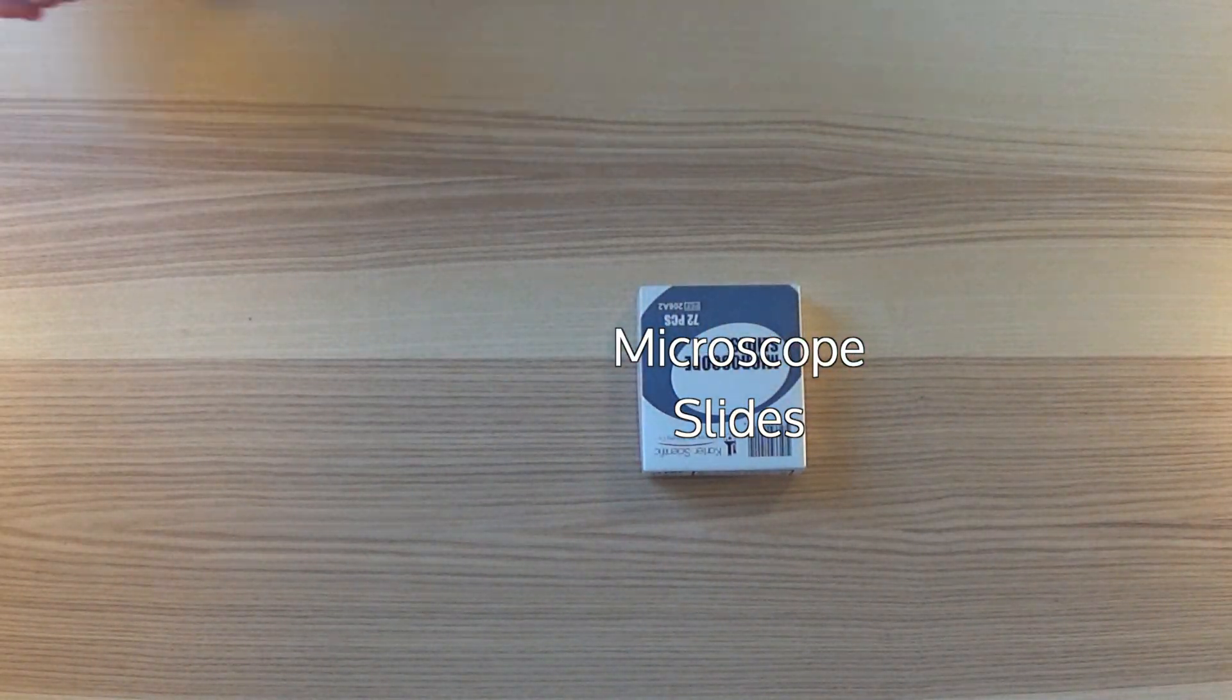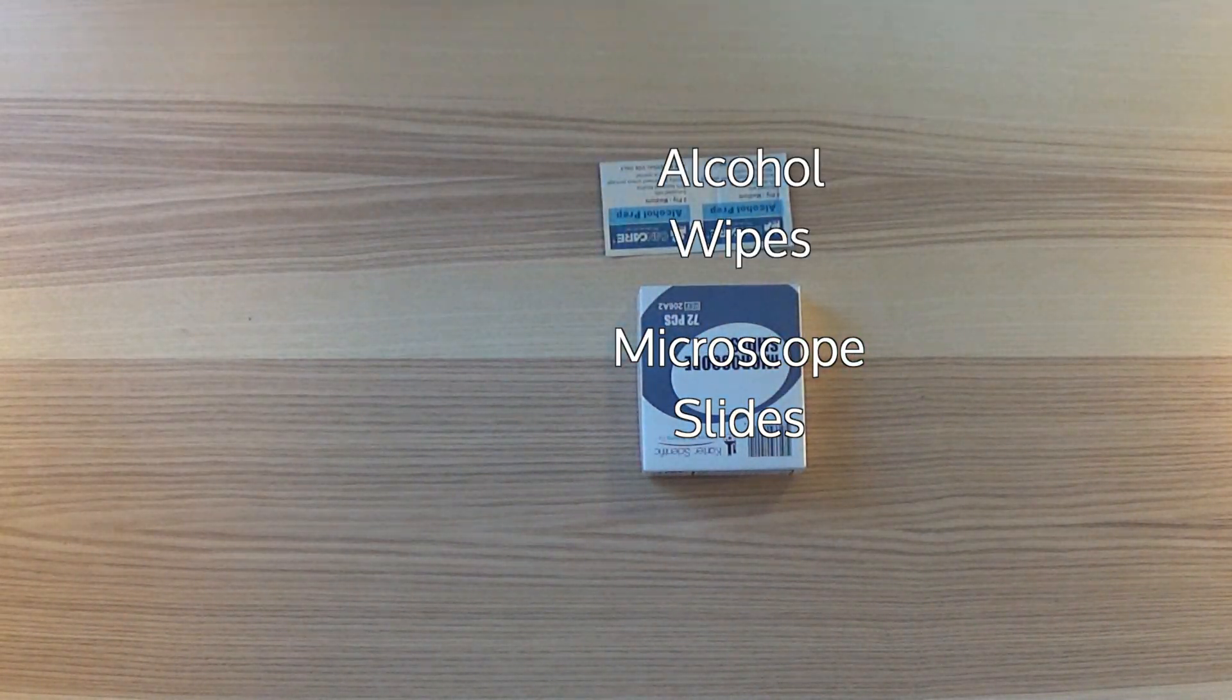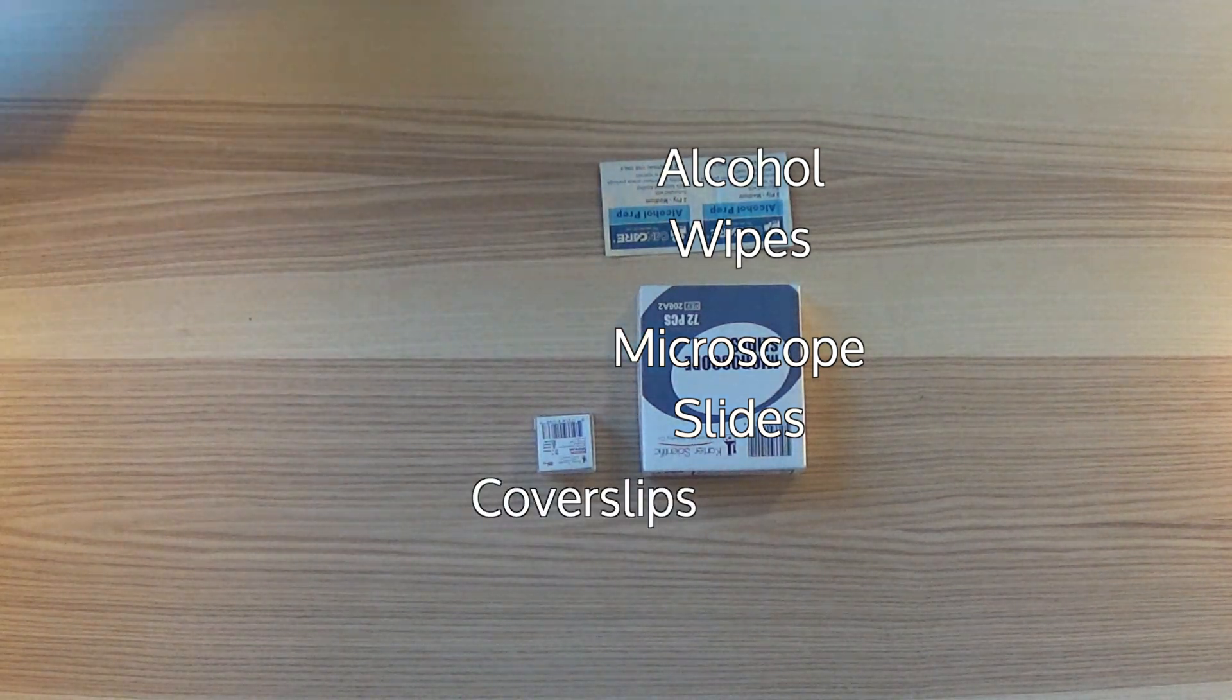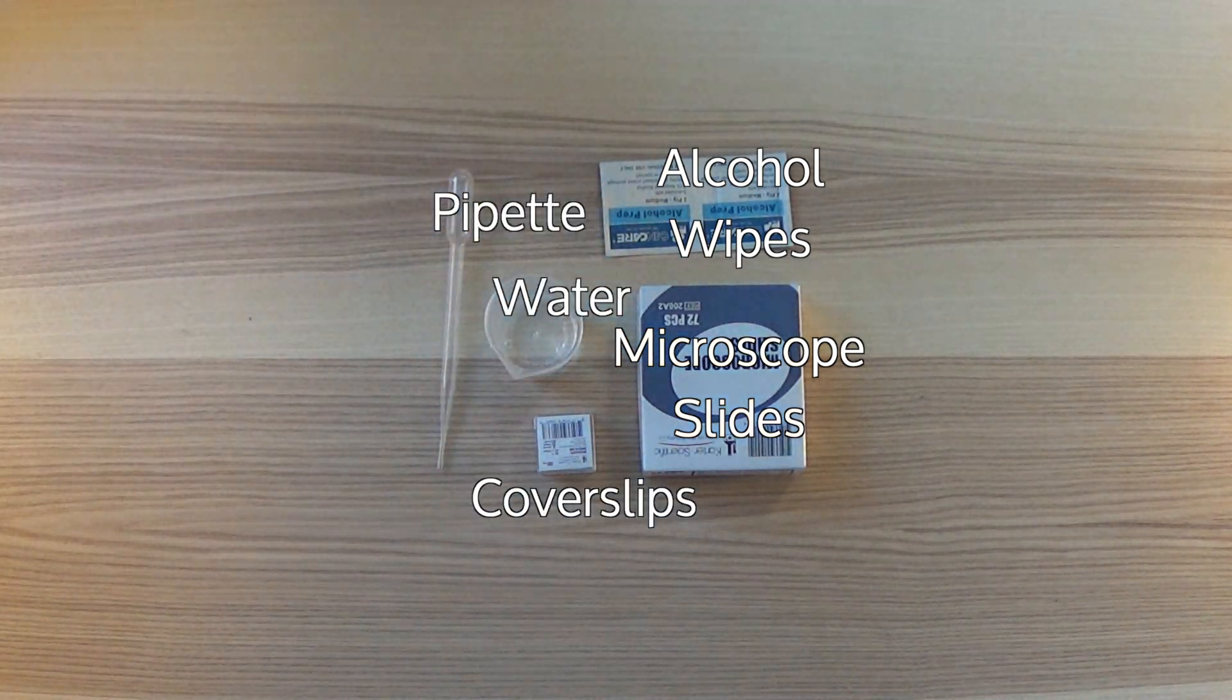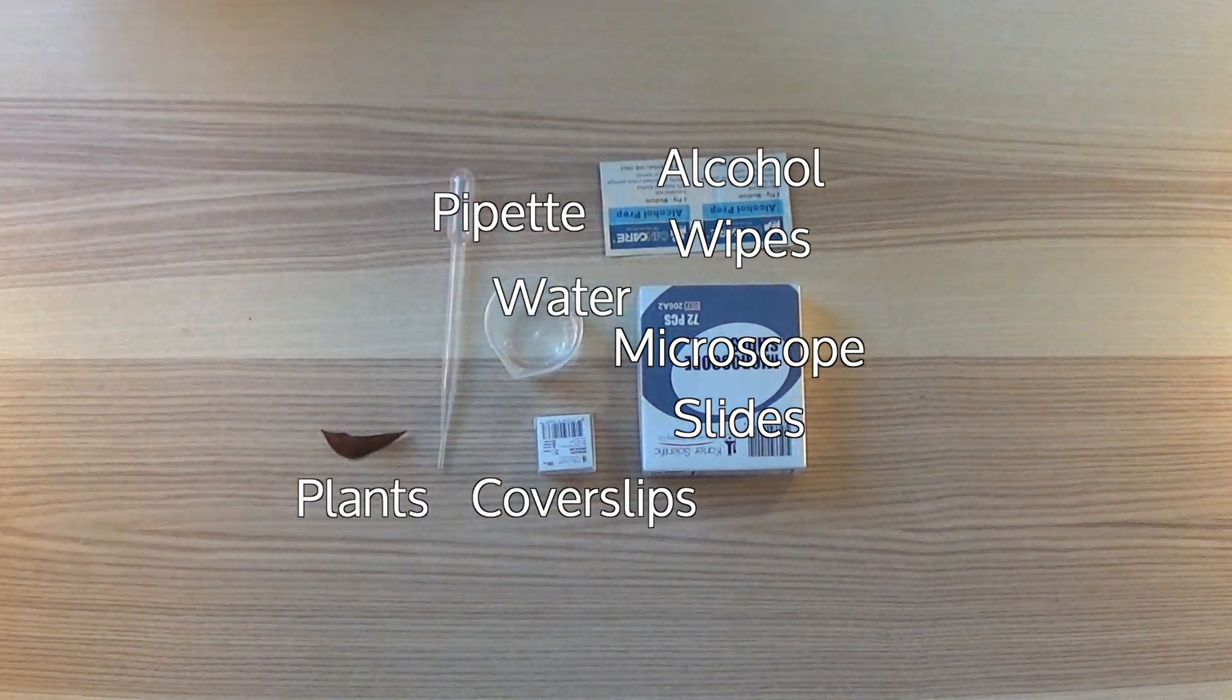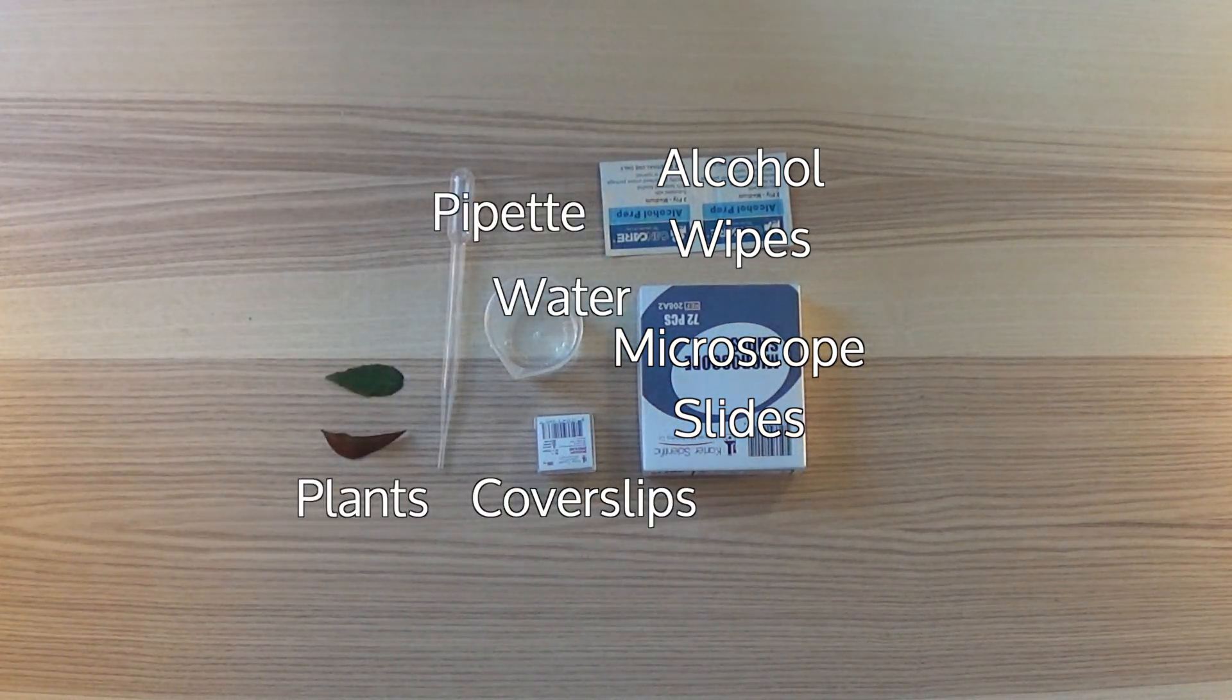Microscope slides, alcohol wipes, cover slips, water, a pipette, and plants.